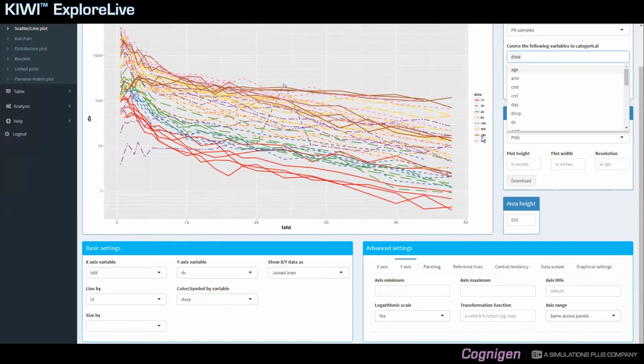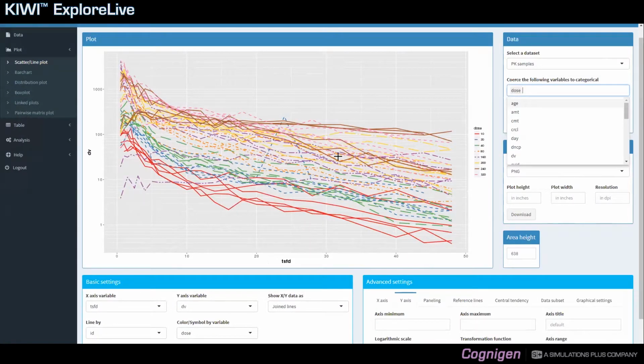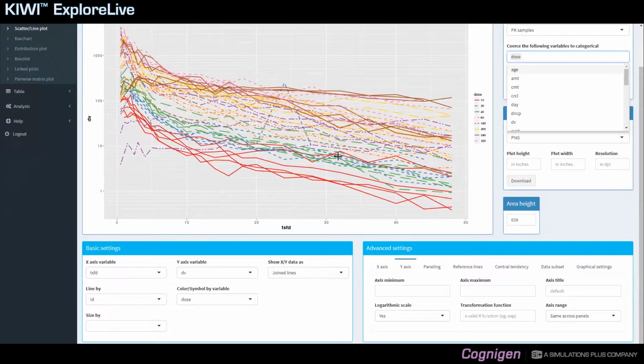If your variable actually has more than 10 unique values, the colors will be recycled, and the line style would stay the same within the first group of 10 values. Line style will change for the next 10 unique values. So this plot is still quite busy and not necessarily super easy to interpret. And to further break down the data, you can use paneling functions.